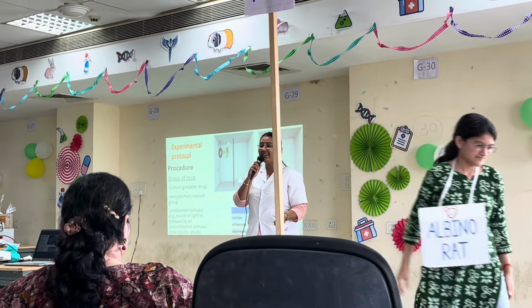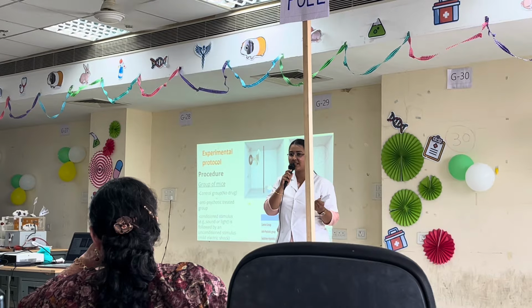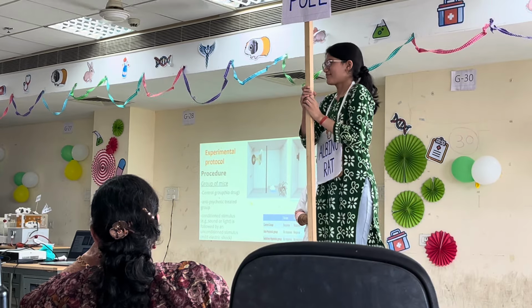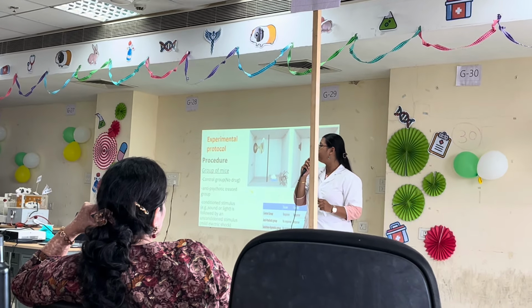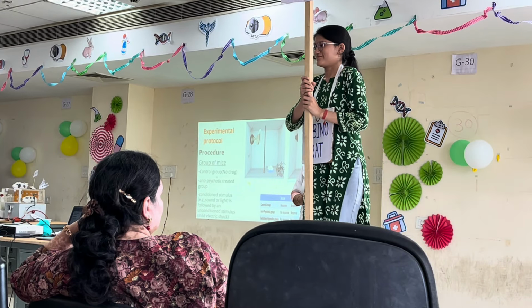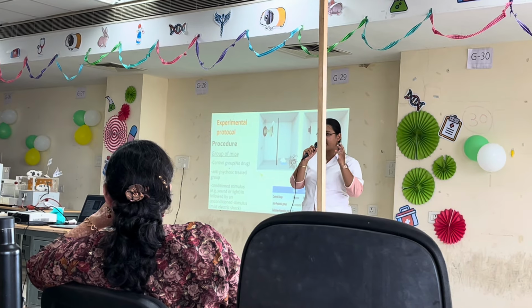As you can see, for the first part of the training phase, with the stimulus of buzzer and current, the mouse produced a response. We are going to train this mouse 3 times. This is the second part of the training phase. This also gave a positive response. Now we have the third part of the training phase. This gave a positive response. So this is the unconditioned response, which is basically governed by the primitive parts of the brain.